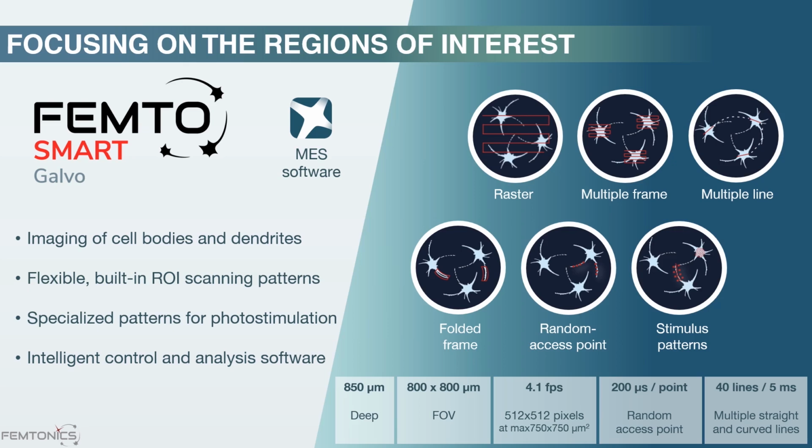The hardware is controlled by our MATLAB-based software called MES, which provides intelligent control while remaining easy to use. Now let's look into the primary applications of a Galvo scanning 2P microscope.